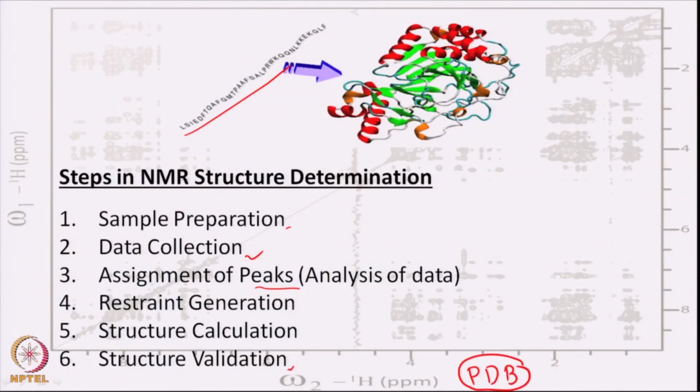That is a single repository for all the structures determined by various scientists, and you can look at the coordinates of each of these structures. So, let us go through all of these one by one.